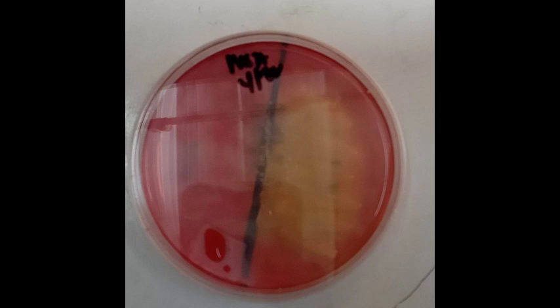On the other hand, the Staphylococcus organism had a yellow halo surrounding its growth, which means it can ferment mannitol and is able to grow in 7.5% salt, which turns the phenol red indicator yellow.